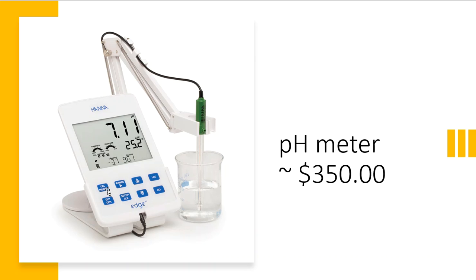So what that means is that I'll put my buffers onto this meter and probe, and I tell it, this is pH of 4, this is pH of 7, this is pH of 10, save it. And now it's going to use those measurements, and it's going to reference those measurements and those buffers when I start dipping it into the solutions that I want measured.